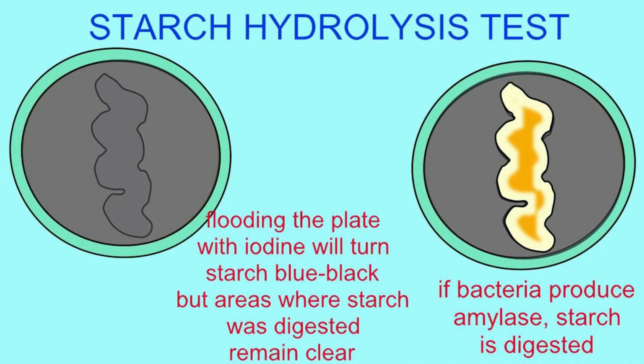I'll quickly summarize what we are doing here. We are looking at those bacteria which are capable of releasing alpha amylase as an exoenzyme in the surrounding area, digesting and hydrolyzing all the starch available in the surroundings. After adding iodine, we can clearly see if starch has been hydrolyzed. If yes, it means no blue-black color around that bacterial colony, which is proof that these bacteria are releasing alpha amylase as an exoenzyme in the surroundings.